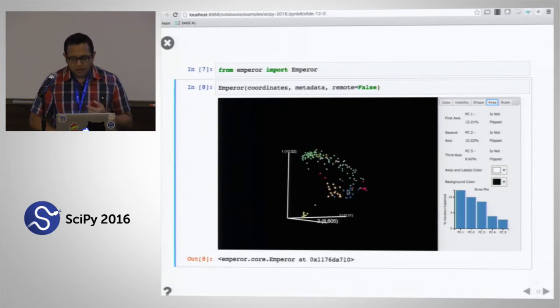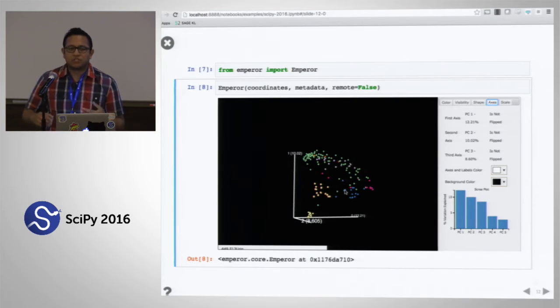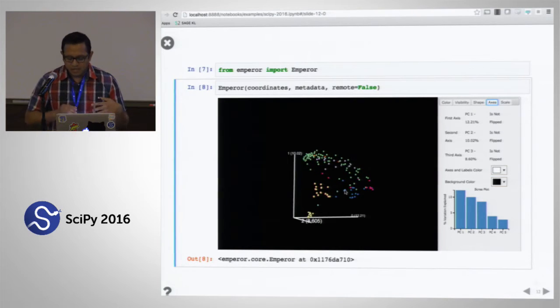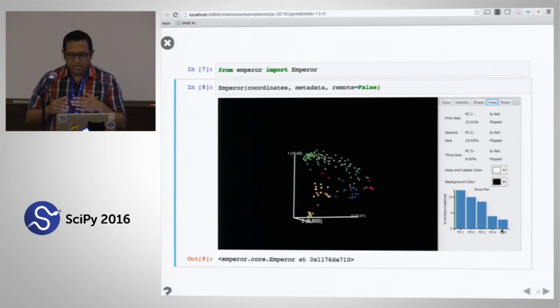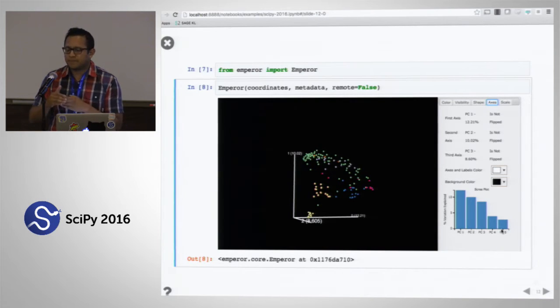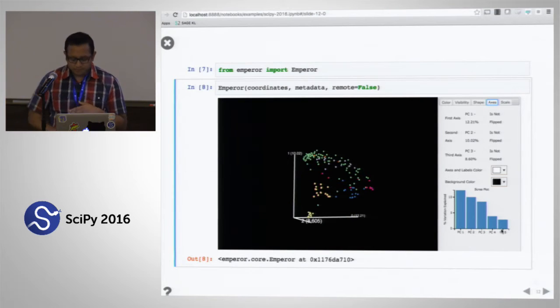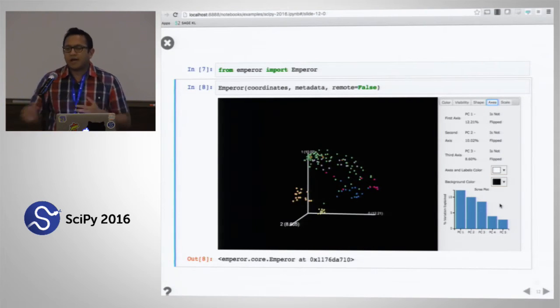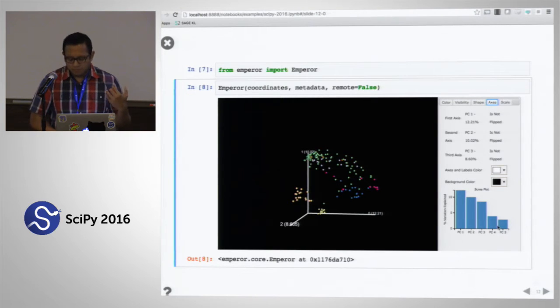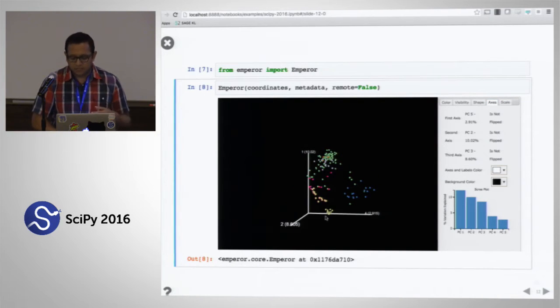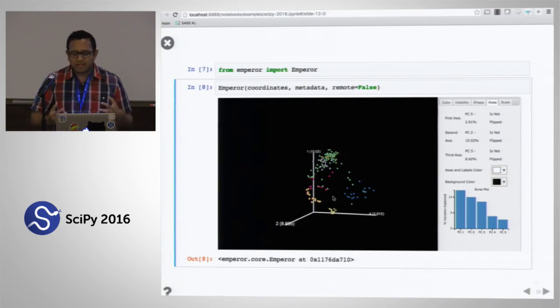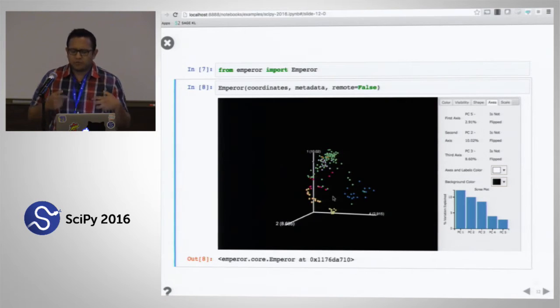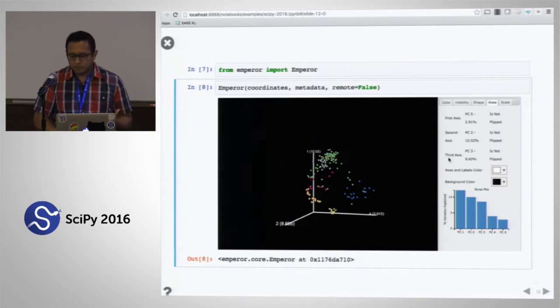Another thing you can do if you're familiar with ordinations is look at your scree plot, which summarizes the percentage of variation for each axis in your ordinated coordinates. You can even swap out the different dimensions — say you want to move the fifth principal coordinates axis to be the first axis. You can do that in the browser and still see separation by body site. We're trying to embrace the fact that Jupyter Notebook provides interactivity and we want to make this tool very interactive.